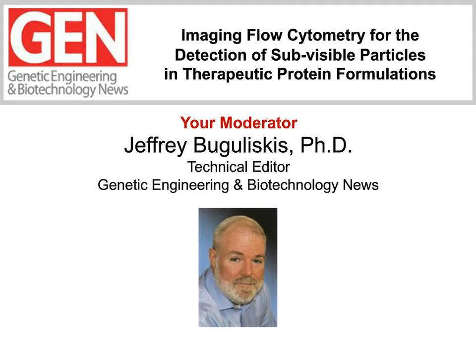Currently, a major concern for the biopharmaceutical industry is the formation of protein aggregates and other sub-visible particles during manufacturing, shipping, and storage, as they can have negative impacts on drug activity and lead to unwanted immunogenicity in patients. It is critical that accurate and effective methods are employed to determine the size and abundance of any protein aggregates formed during the production of therapeutic samples. The challenge, however, in analyzing protein aggregates lies in the unknown nature of the formed aggregates. Many researchers are beginning to overcome these obstacles by utilizing imaging analysis platforms that combine the statistical power of fluorescence sensitivity of standard flow cytometry with the spatial resolution and quantitative morphology of digital microscopy.